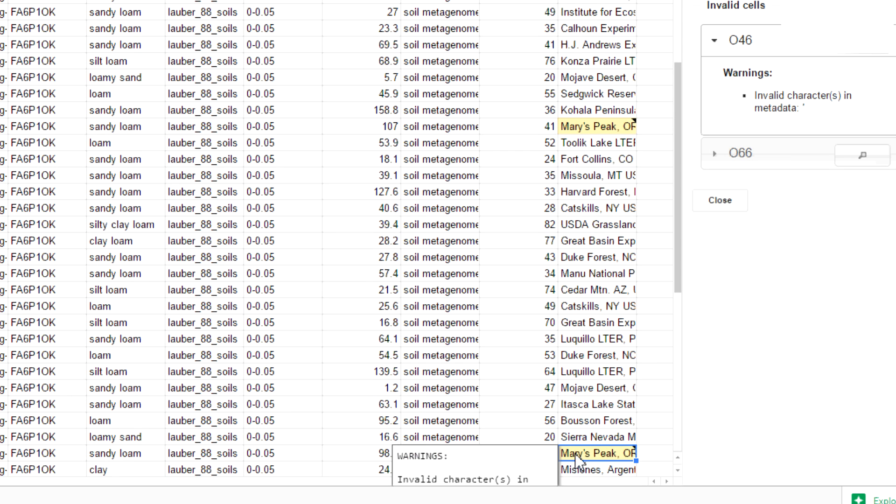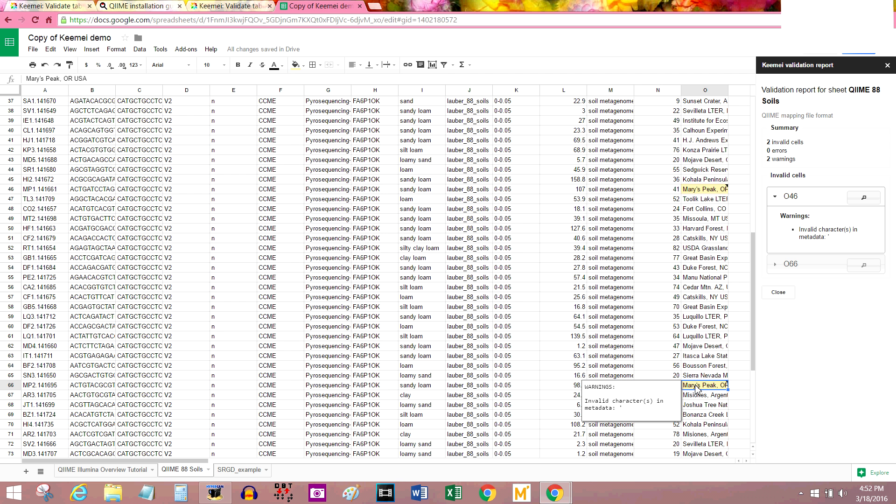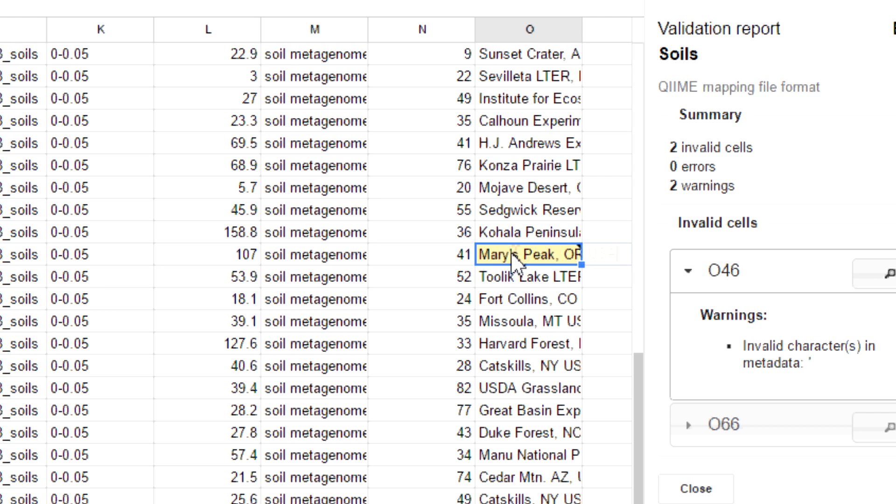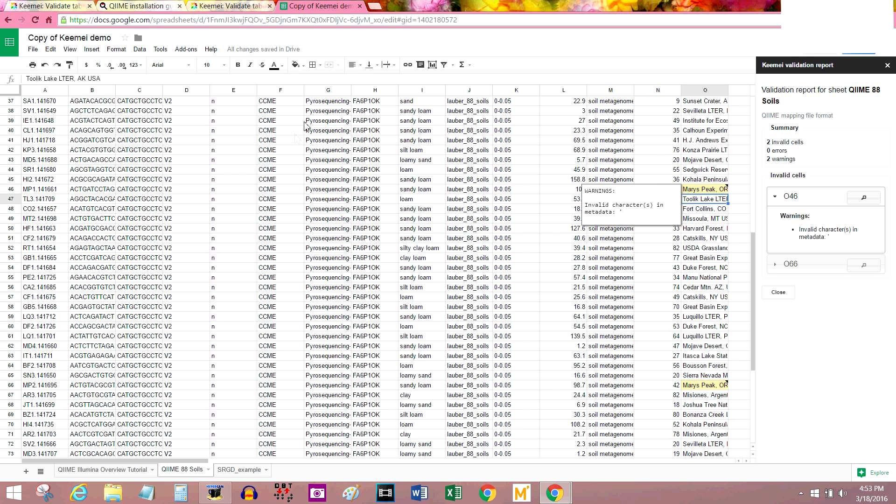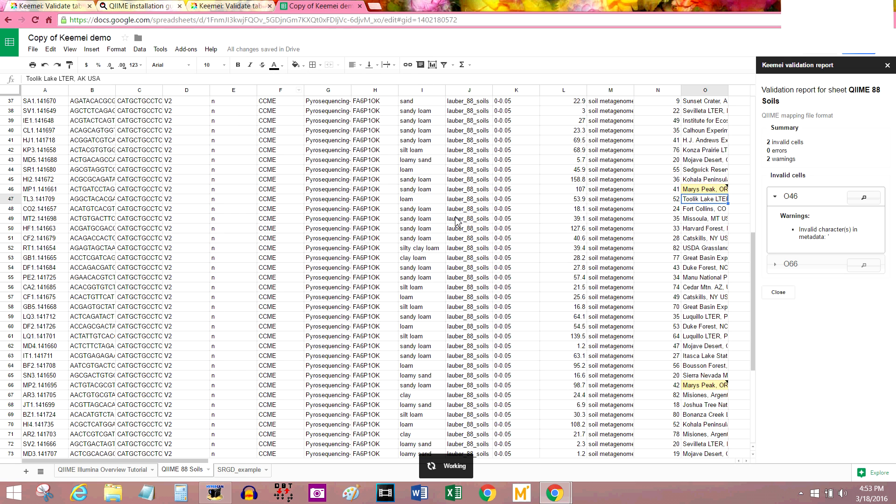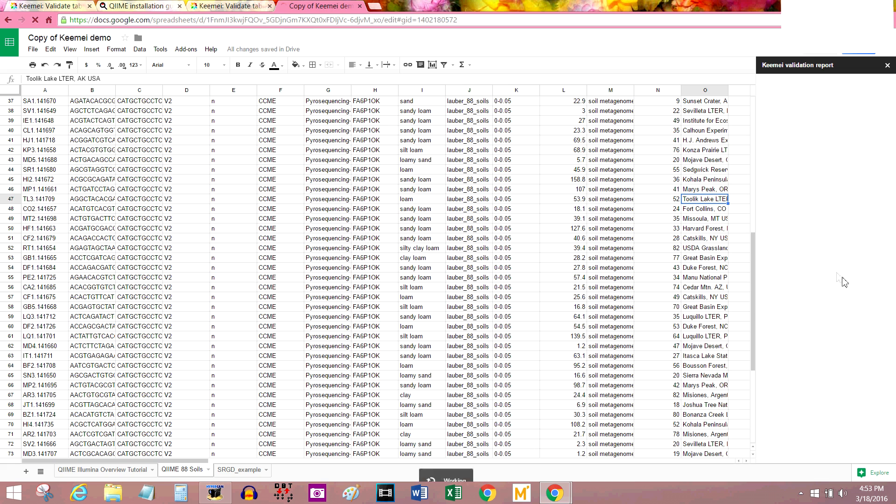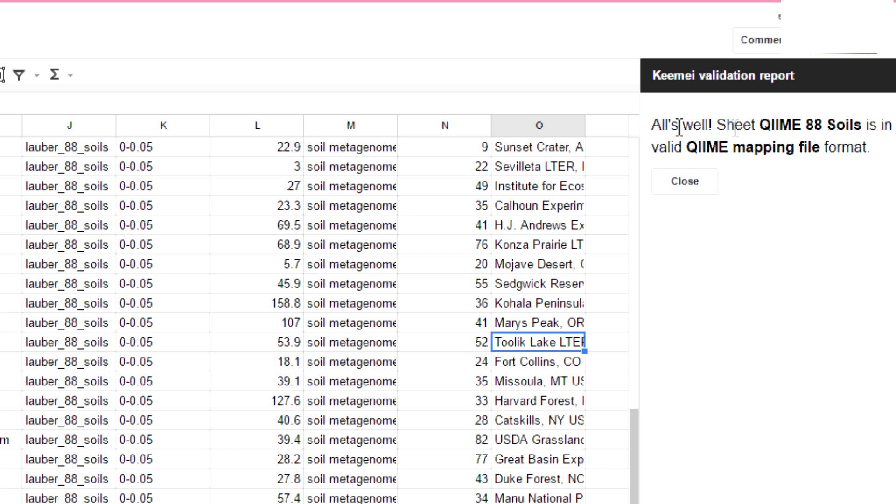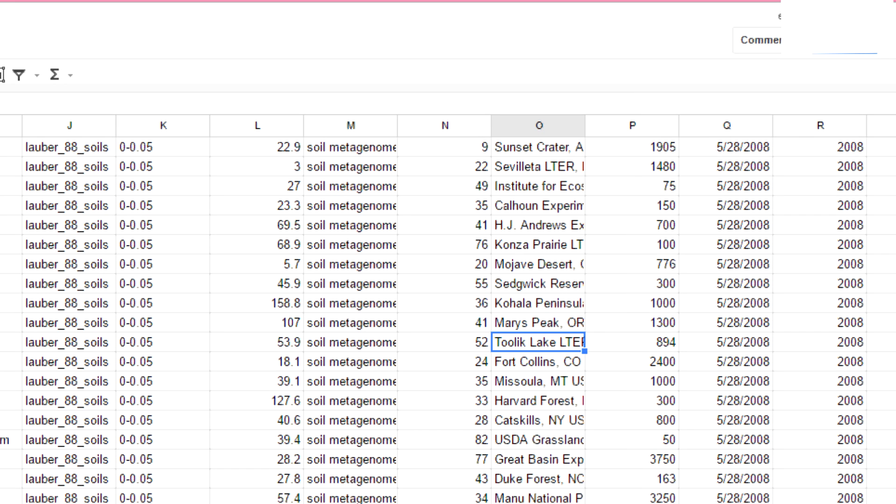You could do the same thing in 066 by clicking on this button again. And it's found the second one. I think the same problem popped up in both. I guess your metadata isn't supposed to have apostrophes in it. I'll get rid of that. I'm going to run this again to see if I've fixed all the problems. Add-ons Keemel validate. Okay. All's well, sheet QIIME 88 soils is a valid QIIME mapping file format. That is awesome.